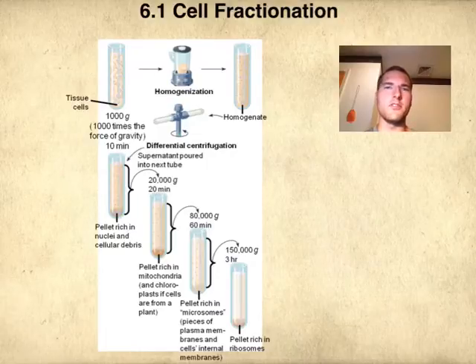And also, this could go through your head as we're going through things: these organelles or these pieces of cells are so small. Like, how in the world do they study them? How do you isolate mitochondria from the rest of a cell if you're going to study mitochondria? Anyway, this is a very simple process that scientists do.